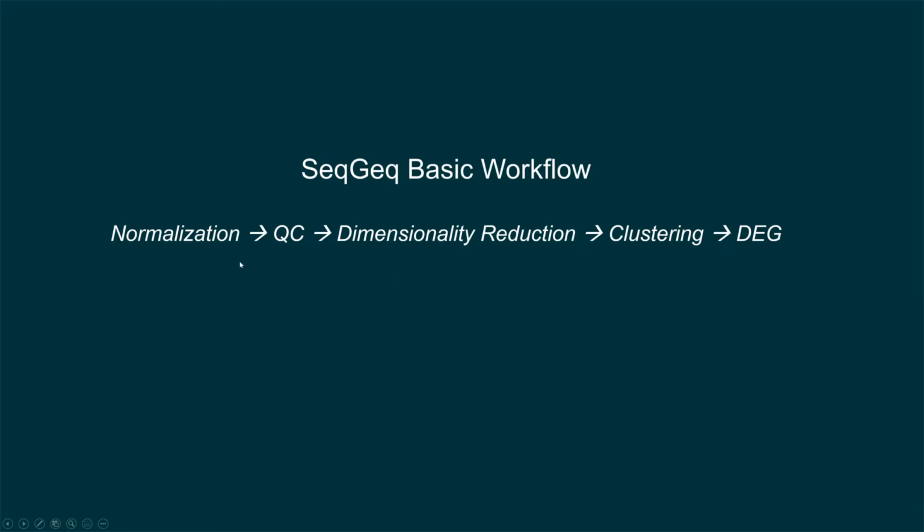So we're going to talk about, after doing our pre-processing, moving into some algorithms where we can get things moving and start to visualize some of our data. And then lastly, ultimately, we want differential gene expression, right? I want to know what makes a population different from another, what genes are upregulated in one population over another. So this is ultimately going to be the heart of the analysis.